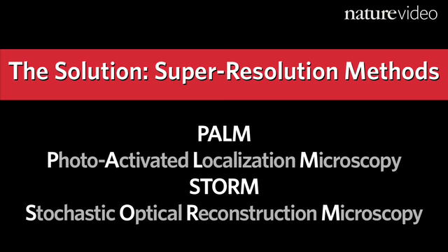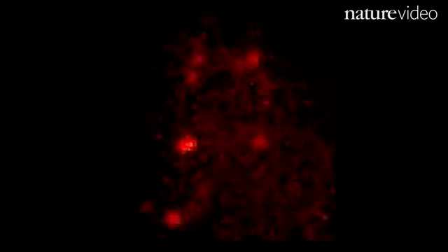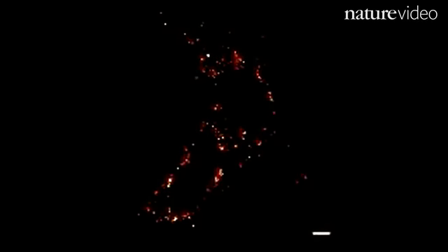The fundamental principles of these two imaging methods are similar, or I would even say the same, because they are both taking advantage of the fact that the molecules are switchable. You could take the blurry spot given off by an individual molecule, and if you could switch off that spot, you could then fit the spot using mathematical equations such that you could determine the center of that spot. And that center is where the molecule is.